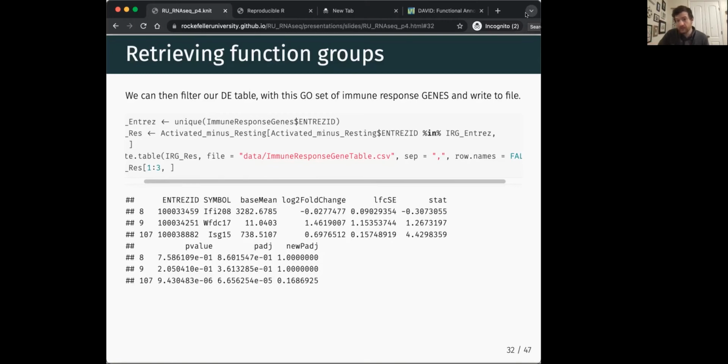Is it adding anything? Because if it is, then it's 100% worth it. But if it isn't, then maybe there are other tools you can use. I believe Ingenuity is more metabolomics focused, so you might want to focus on things like reactome.db, or maybe use some of the tools that give you access to KEGG without having to sign up for KEGG.